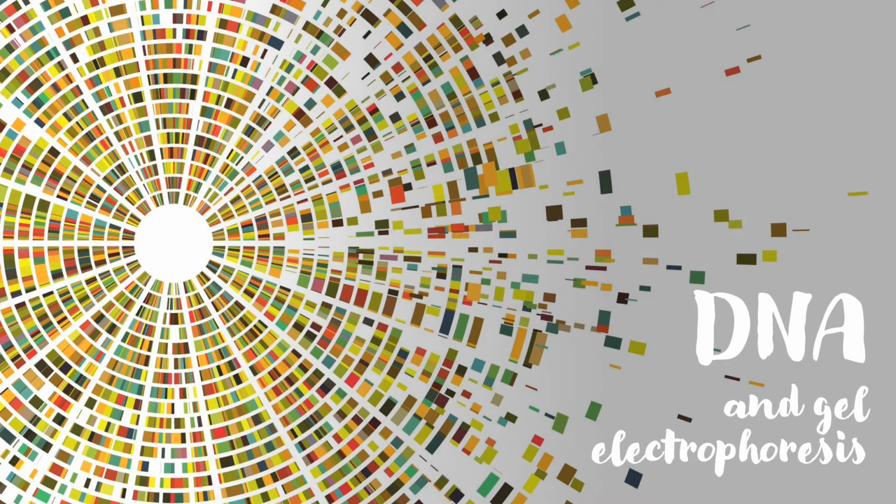In this short video today, we'll take a look at the structure of DNA and how this can be analysed by a particular process called gel electrophoresis to give us all our unique genetic barcodes. This should also help you solve the activities on the TrioSci website.